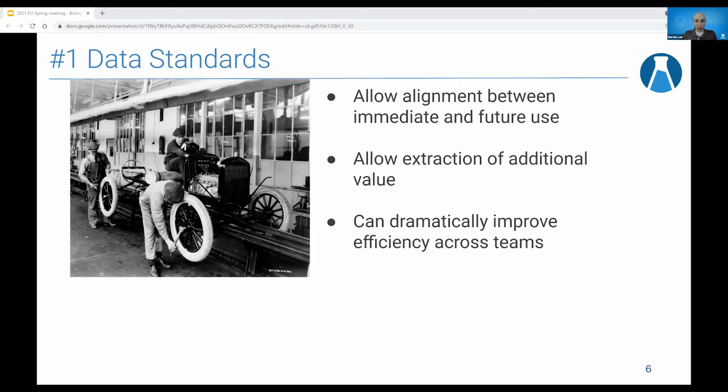Or alternatively, you need to perform some complex statistics or analytics. Is it in the form that is useful? Is it consistent enough across experiments to be useful in aggregate for some kind of process optimization? Or even more extreme, for perhaps the data scientist who's totally disconnected from the bench work itself and lacks a lot of the context potentially, can they do the modeling, machine learning, forecasting that they need to do? All of these scenarios rather necessitate some kind of agreed upon standard so that each person isn't doing extra work all the time, so that we can reduce the cycle time of biologics R&D.